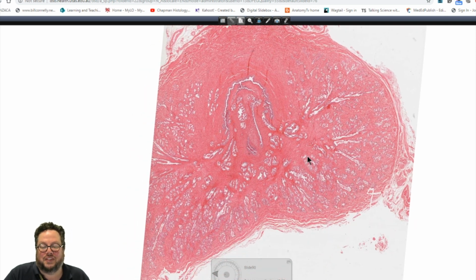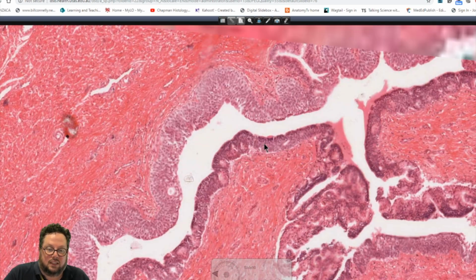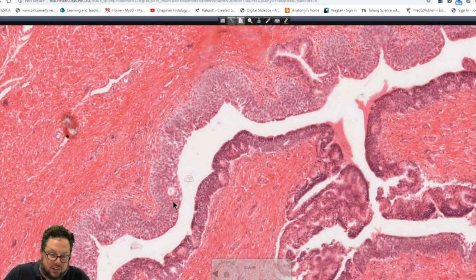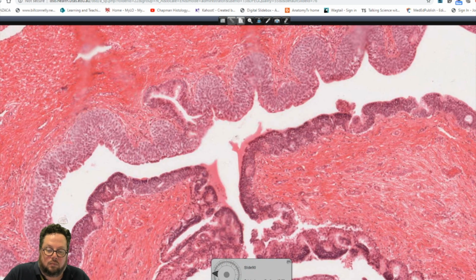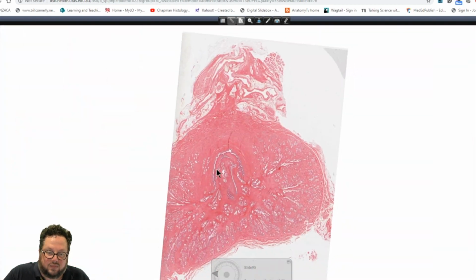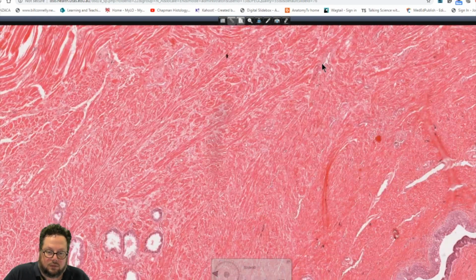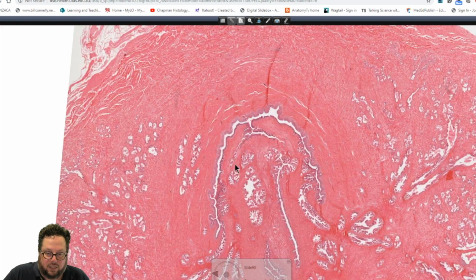All right, so this is the prostate gland. This U-shaped structure here, or upside down U, I suppose, is actually the urethra. We zoom in here. So here's the urethra. We can see this transitional epithelium here on the surface, and we can actually divide, sorry, I can't seem to get that nice region of magnification.